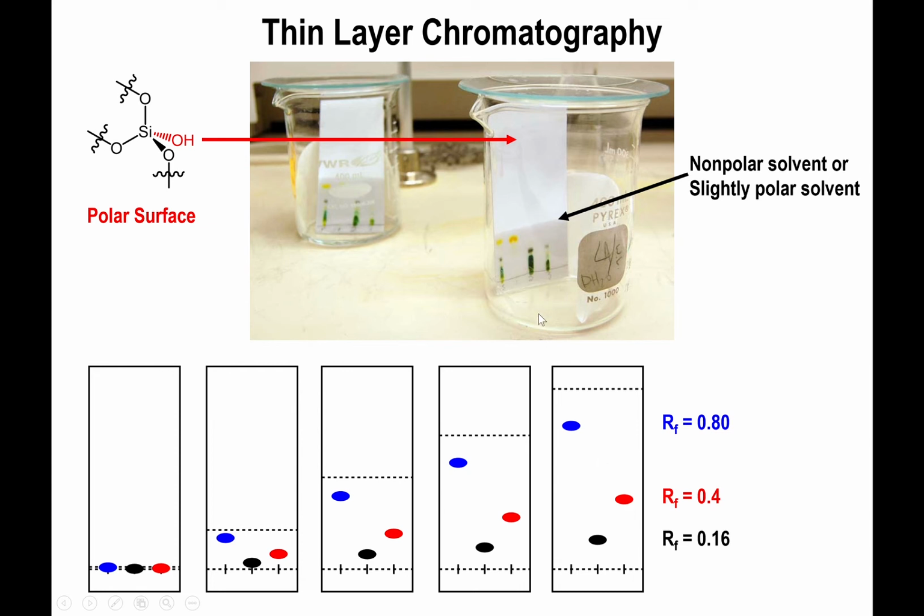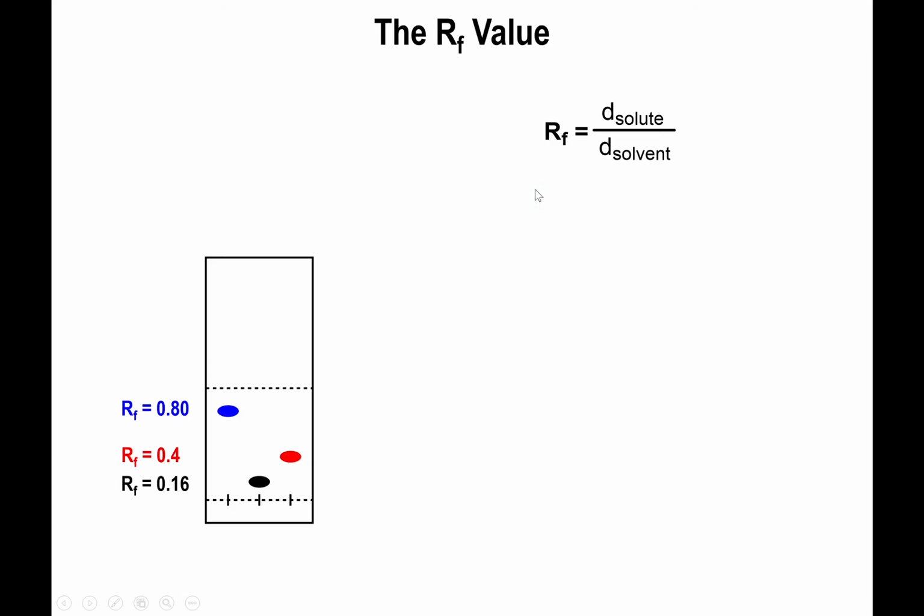But here, solvent is nonpolar, plate is polar. Okay, so the distance of the solute divided by the distance of the solvent.